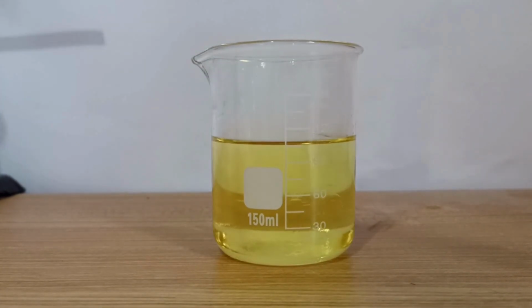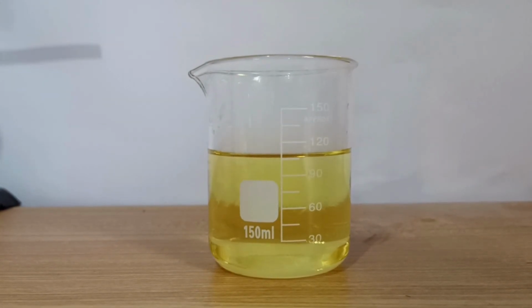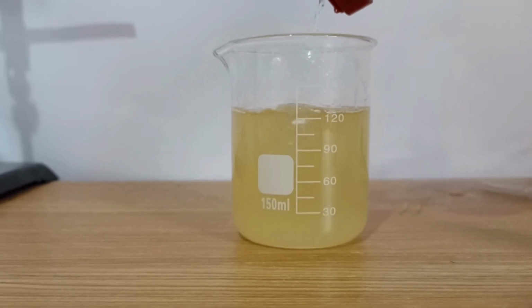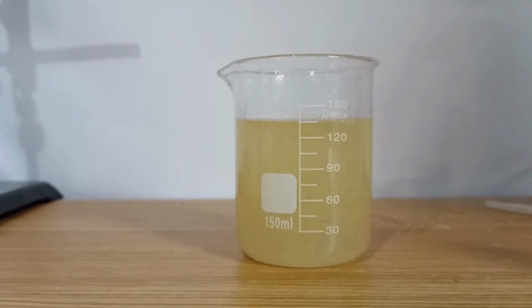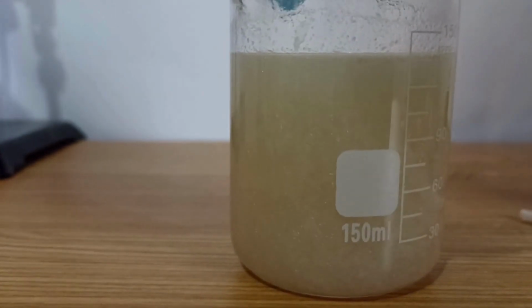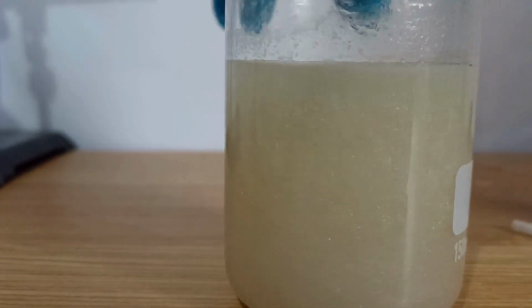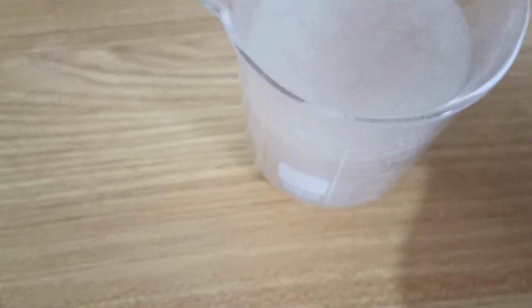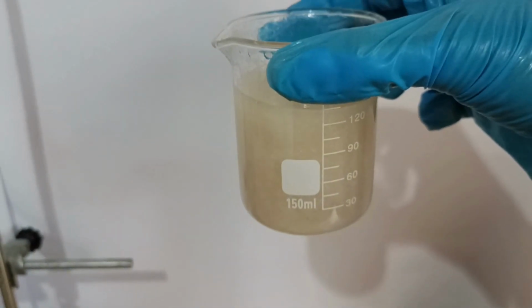So, in order to get free phenytoin, we have to add hydrochloric acid until the pH is between 1 and 2. As you can see, the crystals of water-insoluble phenytoin started appearing. Here is my attempt to get a closer look, but my camera is just bad.